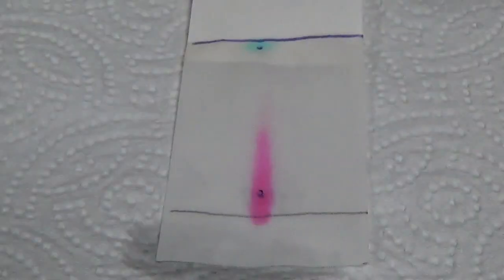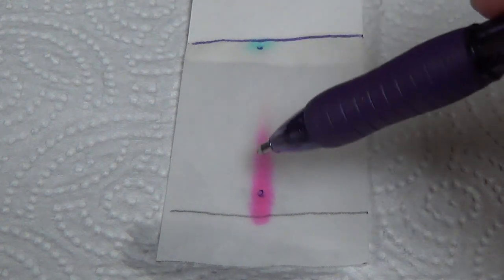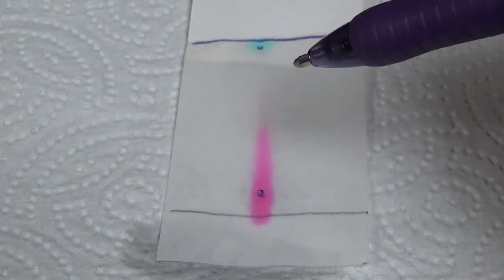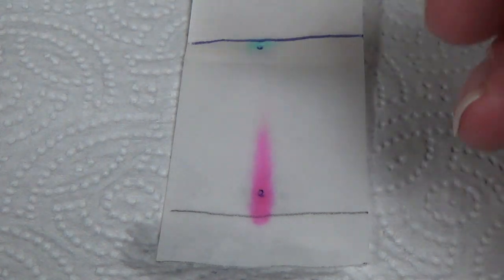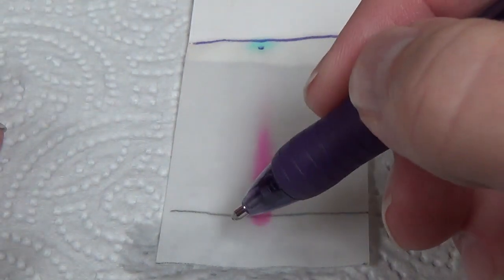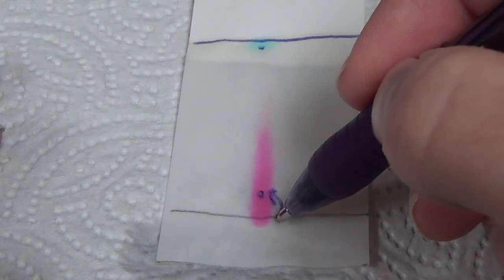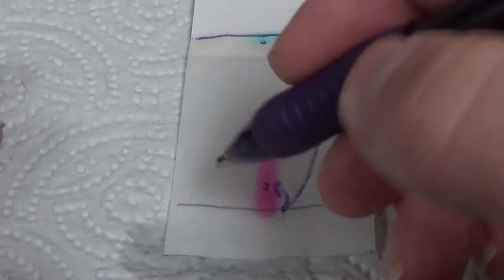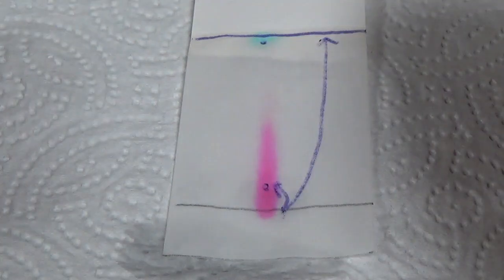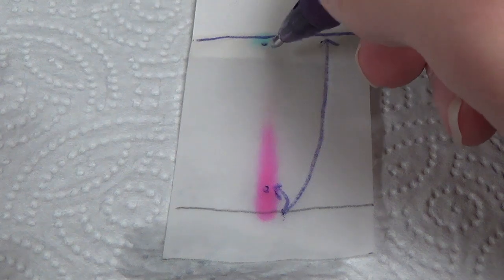All right. So we have our solvent line marked. We have the center of our blue blob, center of our pink blob. What I need to do now is calculate a thing called an Rf, and that is the distance from the start line to how far the center got divided by the start line to how far the water line got. And since I have two colors, I need two Rfs. I need an Rf for the pink, and then up here I need an Rf for the blue.